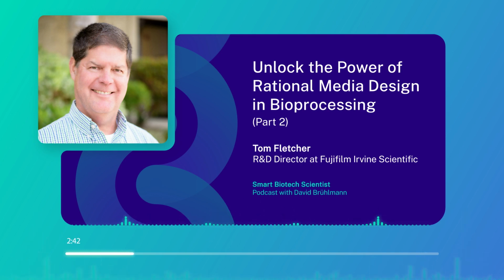Maybe it's something more about the higher viability. Maybe that's what it is with cell therapies. I think that's probably more important than the cell density. Because perfusion has been a popular topic lately, what might surprise some people is you might actually want slower cell growth. The cell division creates kind of a waste stream in a steady state perfusion process. So companies like BI have actually found ways to inhibit the cell cycle so that you have slower growth and you can reduce the amount of bleeding that's required to maintain a steady state in perfusion.